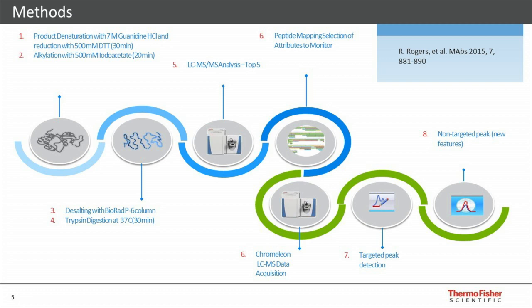I call this the final sanity check. It's actually the final quality check. It's making sure that there's nothing unexpected. I think our former secretary, Don Rumsfeld, would say this is an unknown unknown. It's making sure that nothing that you weren't looking for suddenly appeared, that there's a change that you were not expecting to see that suddenly happened. An impurity, rapid change in one of the attributes, this will pick it up. It's kind of a blind final check.